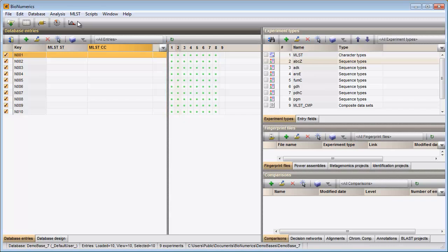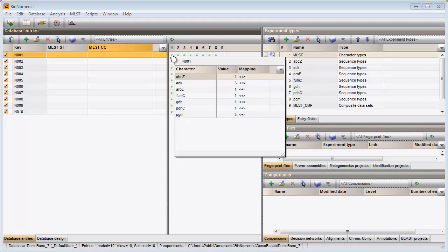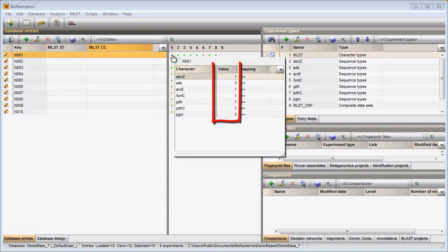To view the allele IDs for a certain entry, I need to click on the colored dot in the MLST column. The housekeeping gene names are displayed in the left column. The allele IDs are shown in the middle column.